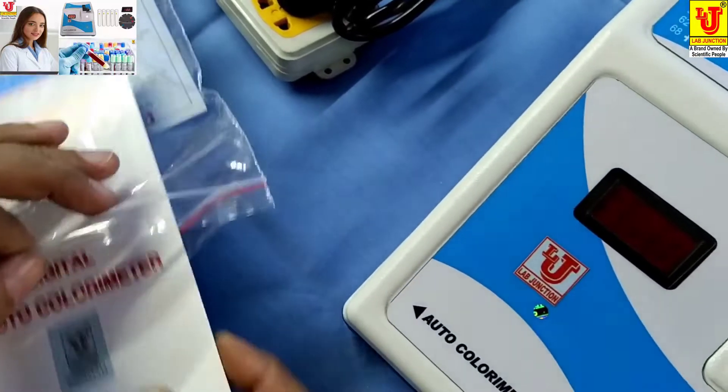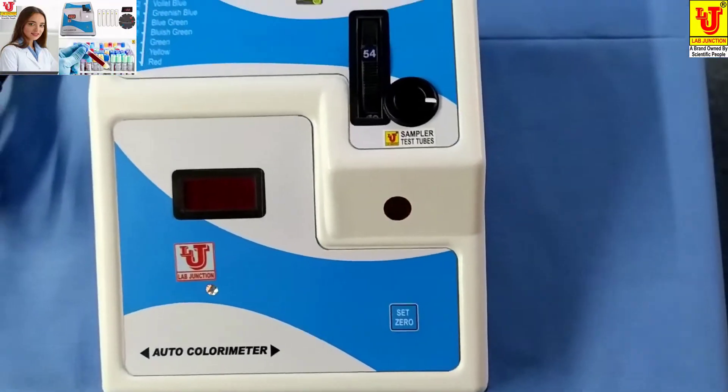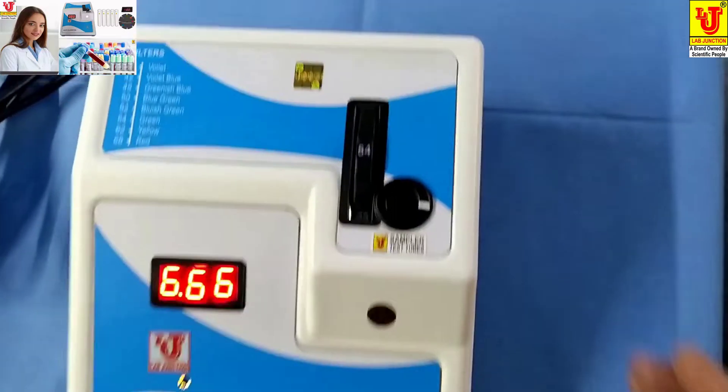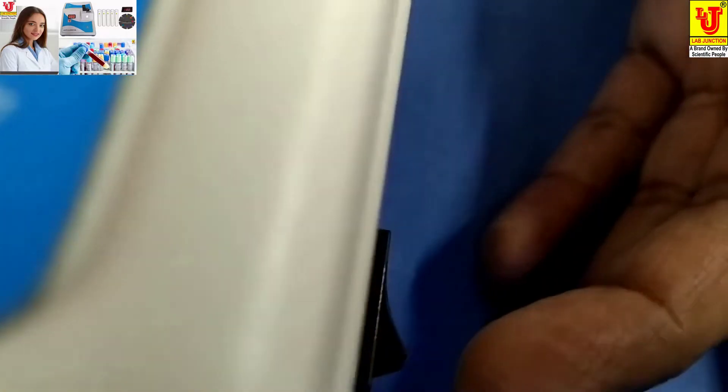Now, how to use this colorimeter? First of all, switch on the machine. This is the front view, side view, back view, and the on/off switch is on this side.